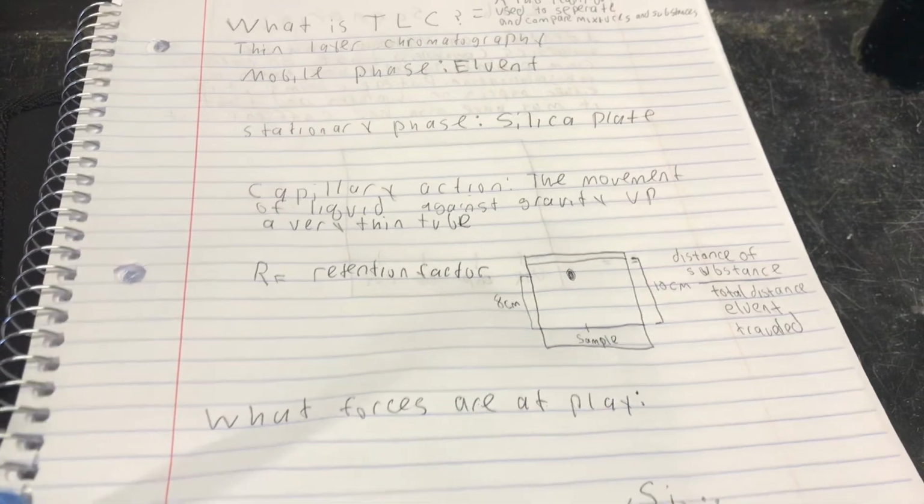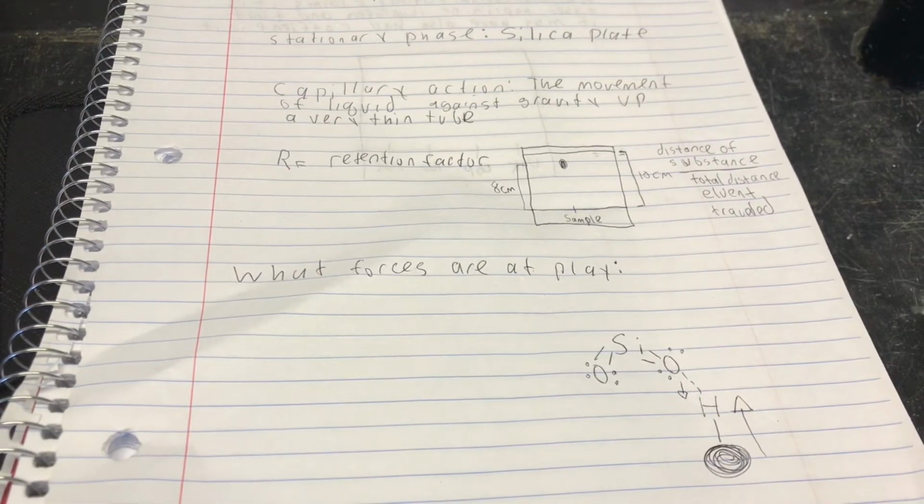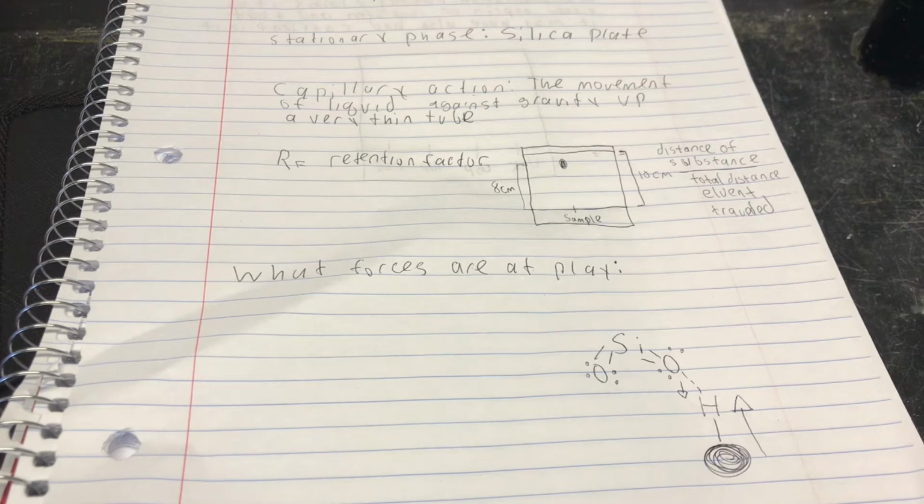One more thing: what forces are at play? Of course, this stuff doesn't just happen through magic. There are different things that occur at a molecular level, which account for the separation between the substances that you're testing.